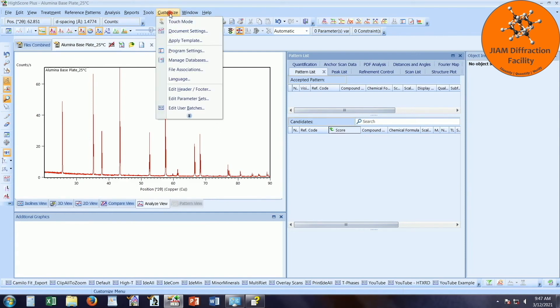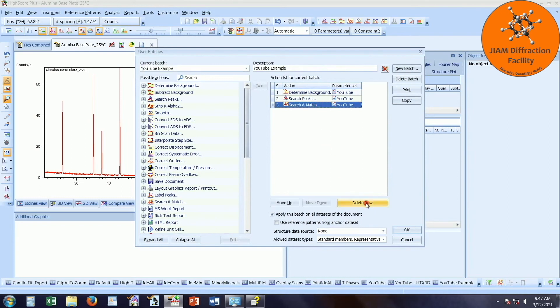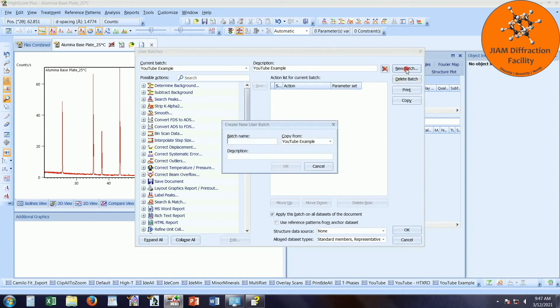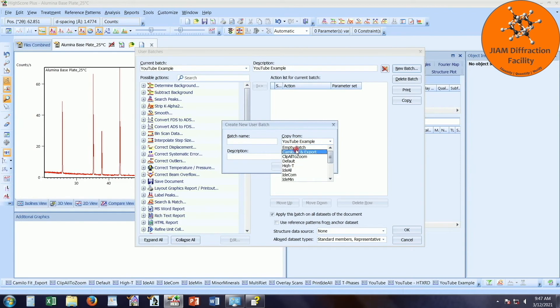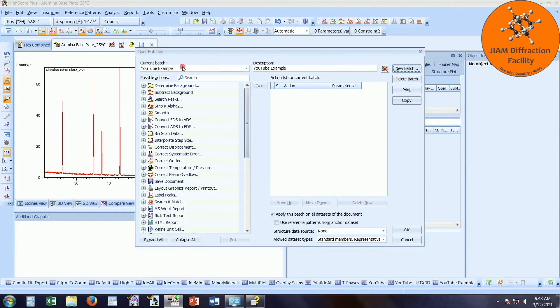Let's go up to customize, edit user batches. Here you see I already have my YouTube example. I am going to delete all of this. Only delete these rows if you need to. Do not delete these if you are going to make a new batch. You could click new batch if you want. And you can put in whatever batch name you want. You can copy the batch from some other pre-existing batch if you like. Or you can just make it an empty batch. And then you can give it a description. And then you would click OK. But I am just going to use this YouTube example that I already cleared out.